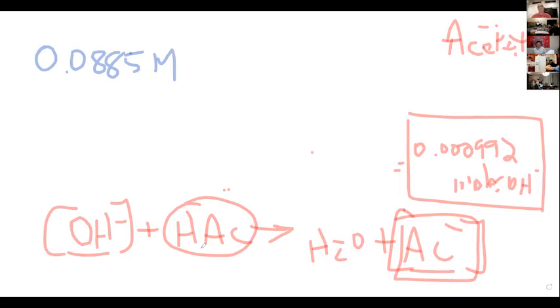It seems to be about 10-fold less concentrated than the acetic acid we're using. We want to see how many moles that is. The volume at the beginning was 20, 21, let's say 21 mL.